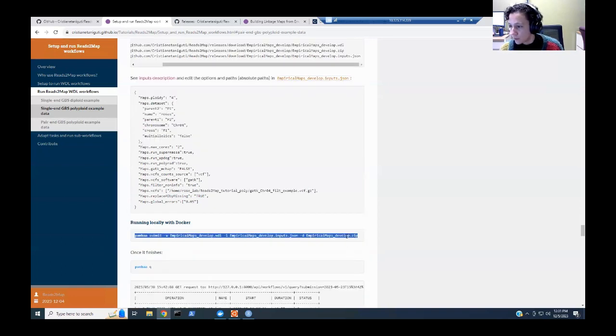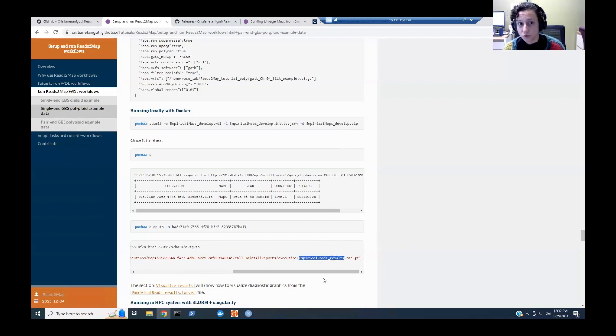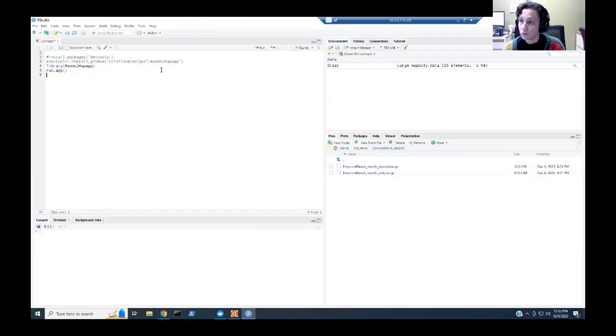And to run the same thing, just submit it, and Pumba will give you all the interactive ways of seeing what's happening with the run. And the final file is a tar.gz file that has the results for the maps. And this file you can download, and you can submit to a Shiny app that is available here.